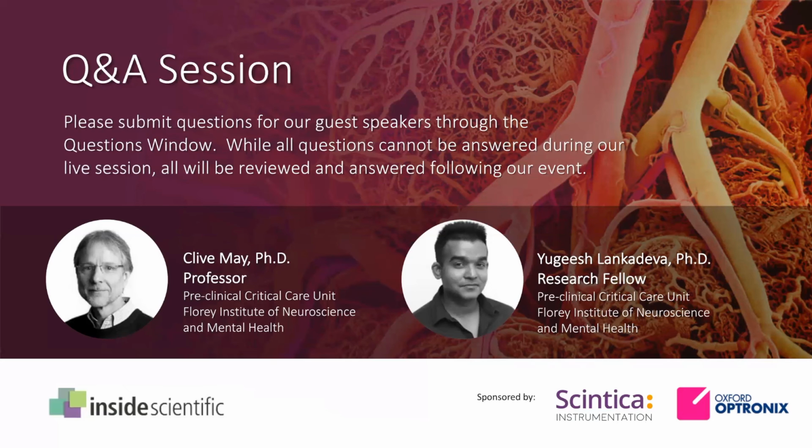Great. So actually, I might just jump ahead a little bit here and ask this question to you, Michael, as well. Can this be used for measuring perfusion in other organs, such as the liver or heart? And I know we were talking just a bit about a couple of different animal models. Is there any animal model where this procedure wouldn't apply? I can't really say. I don't believe there's any animal model that we exclude for any particular reason.